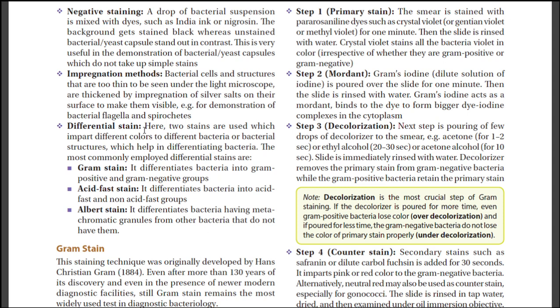Same here, two stains are used which will impart different colors to different kinds of bacteria and help in differentiating one category of bacteria from another.